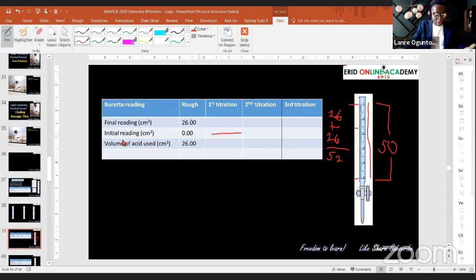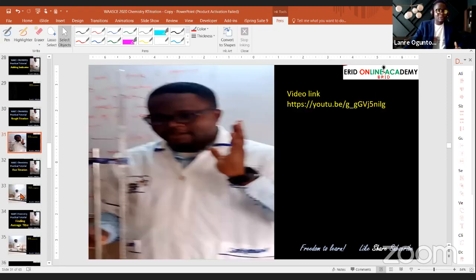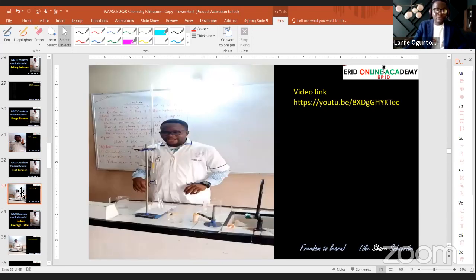So in the video, I'm going to be adding more acid after my rough titration so that you understand the reason why. Okay, so let's move on.